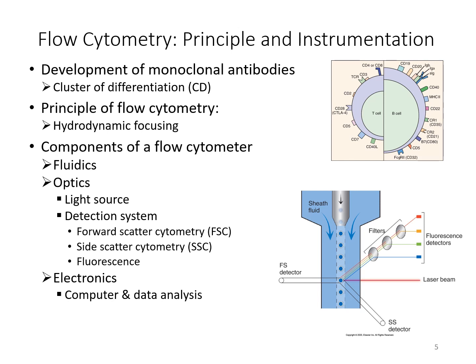So fluorochromes are excited by a very high energy source, and the optical detectors will convert that scattered or emitted light from those cells into various electronic impulses, which are sent to various detectors using optical filters. Those pulses and signals are then processed within a computer system for analysis, classification, sorting, and separation of cells. That's done based off that detection system, where it's looking for forward scatter, side scatter, and of course the fluorescence.